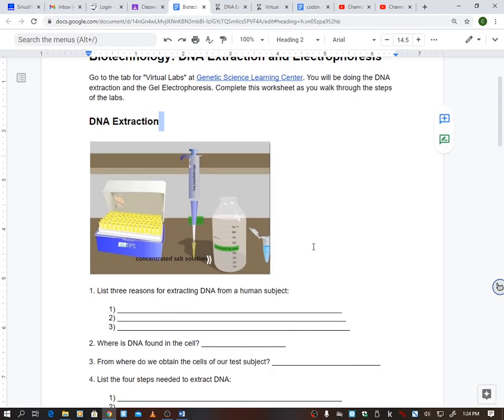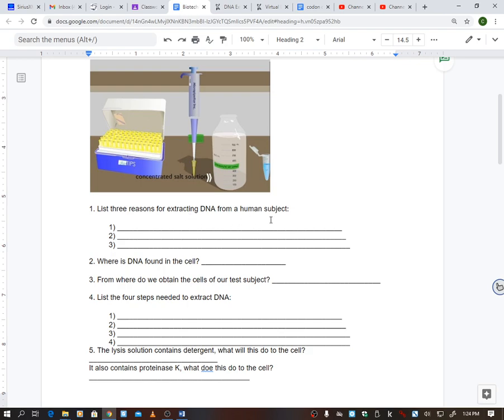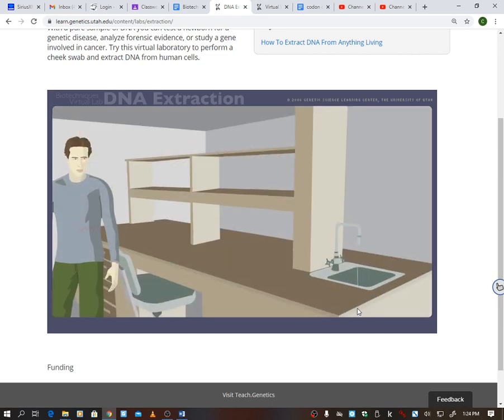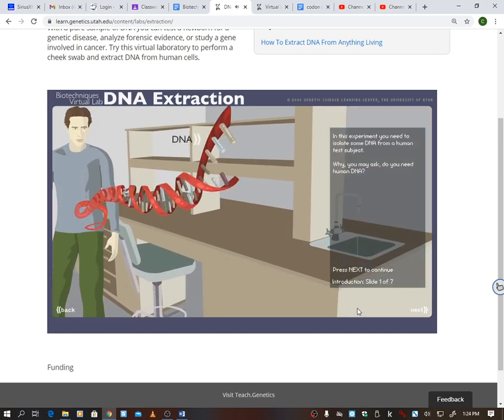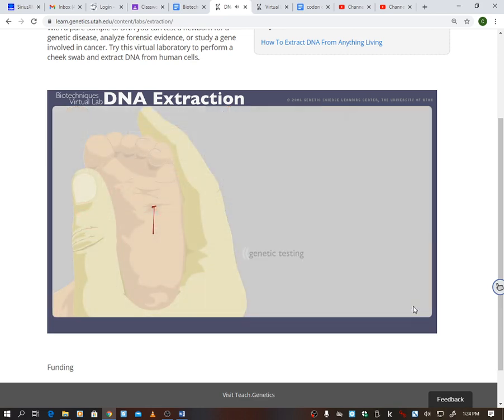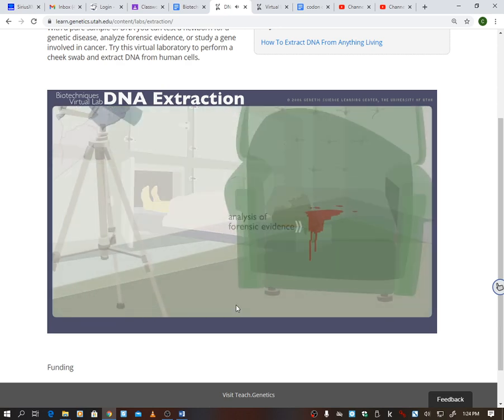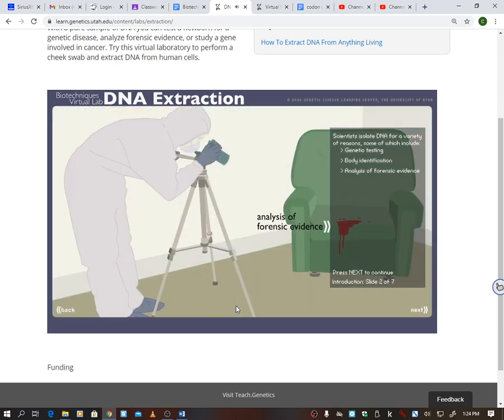As you start the lab, it says list 3 reasons for extracting DNA from a human subject. Alright, so we're going to start the lab. It's going to show this. Why, you may ask, do you need human DNA? And then it's going to walk through genetic testing, body identification, and analysis of forensics evidence. Now it is up here, but if you ever need to go back a slide, you always have that option of going back a slide, okay?